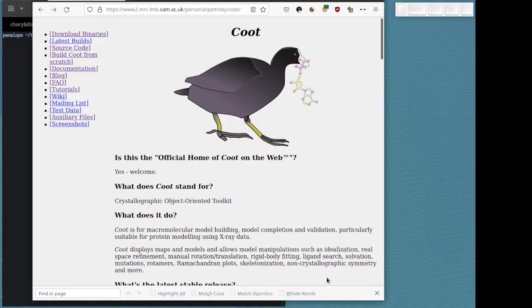What I'd like to demonstrate today is the use of Coot with Geman-McClure restraints. The way I've done that is to provide a demonstration file.